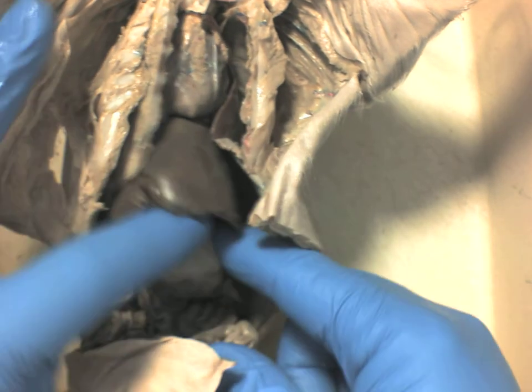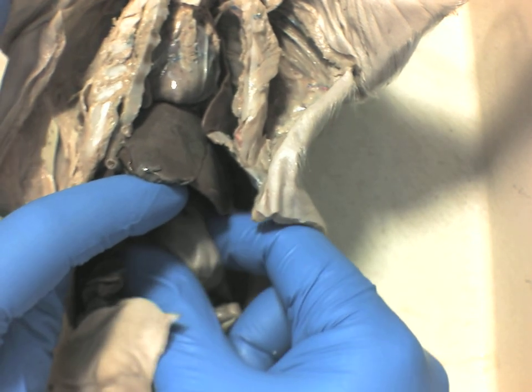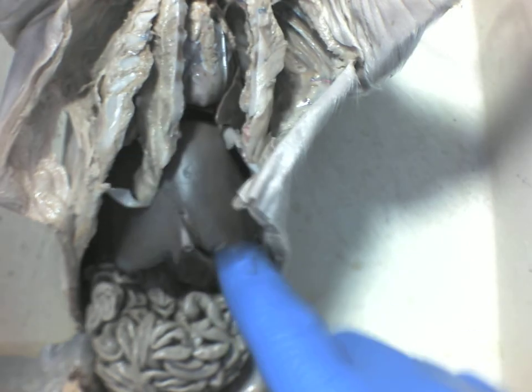Eventually you go into the stomach. And you'll notice the stomach is just a pouchy organ. This is the pig stomach. It's very different from what you might have thought. The stomach itself is going to churn up the food and mix it up with the acid. That churning, what type of digestion is it? Mechanical, very good. And we also have chemical digestion taking place in here. What part of food is broken down in the stomach? The proteins, very good. So the proteins are broken down.